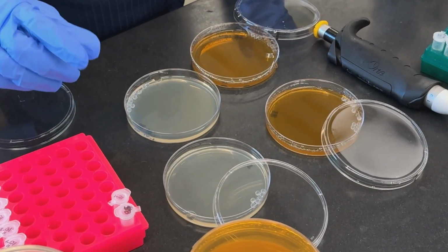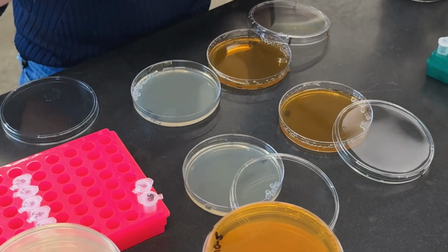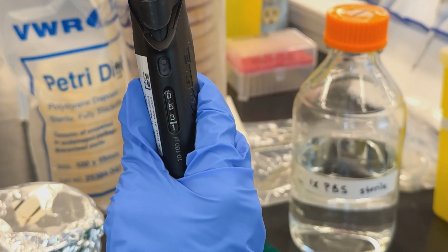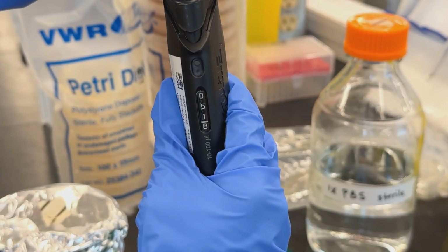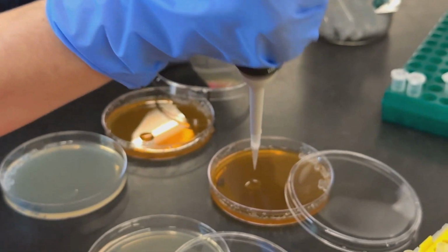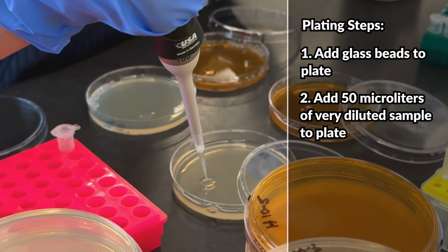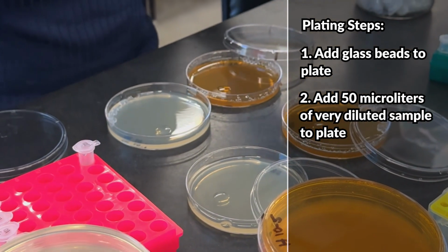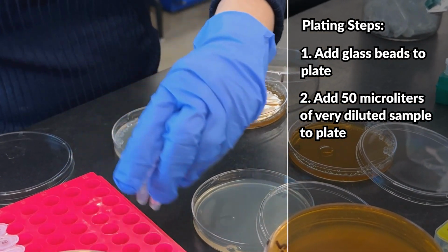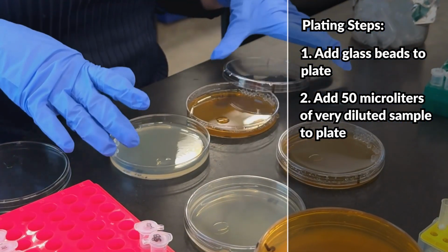What I'm going to do is take my 50 microliters. I need to change this back to 50. I'm just going to dot a little bit onto the plate. I'm not going to touch the plate with the tip, because you don't want to make a hole in it. And then I'm going to move it off to the side because now I know that I've plated it.